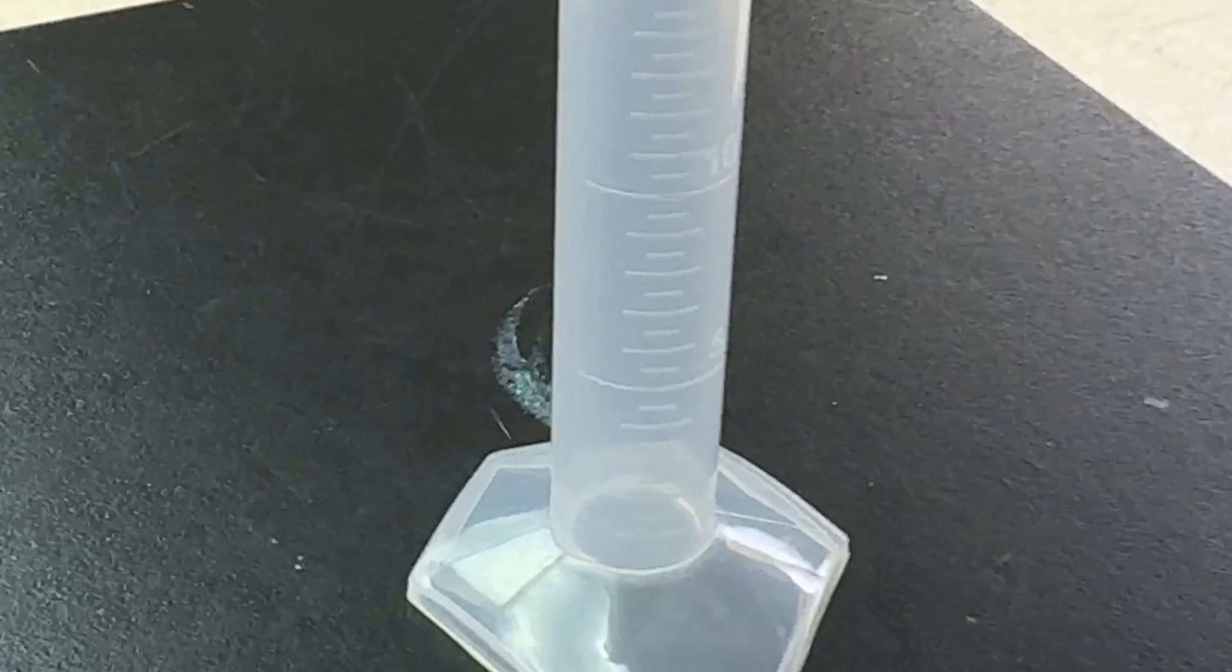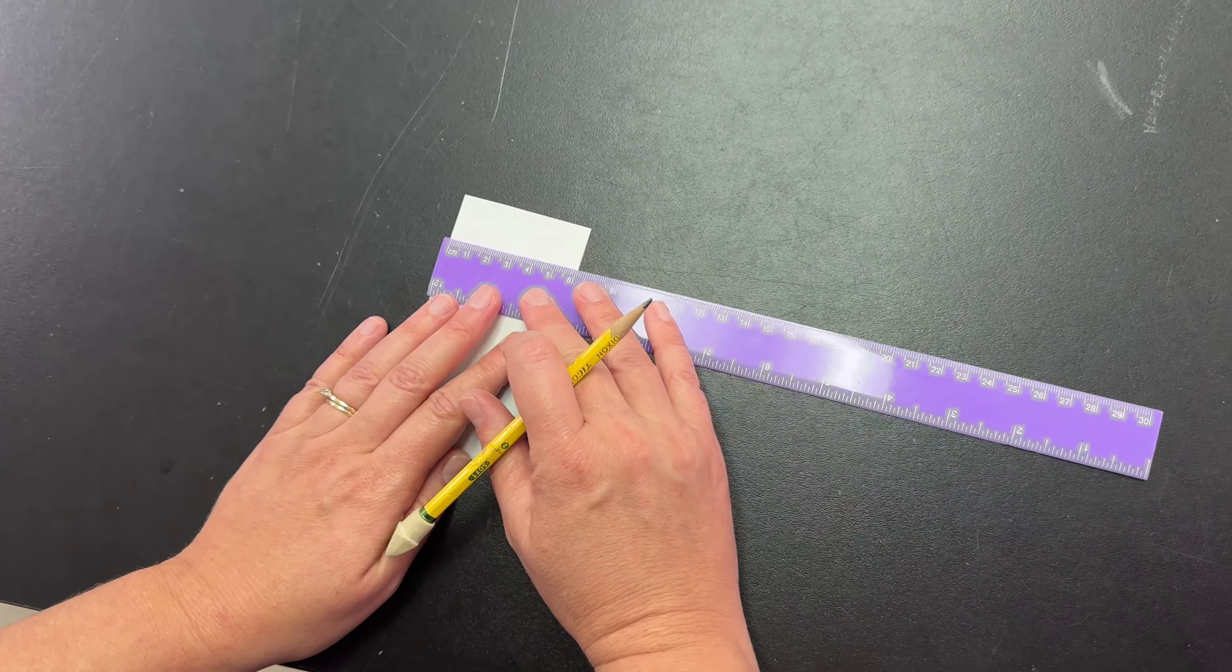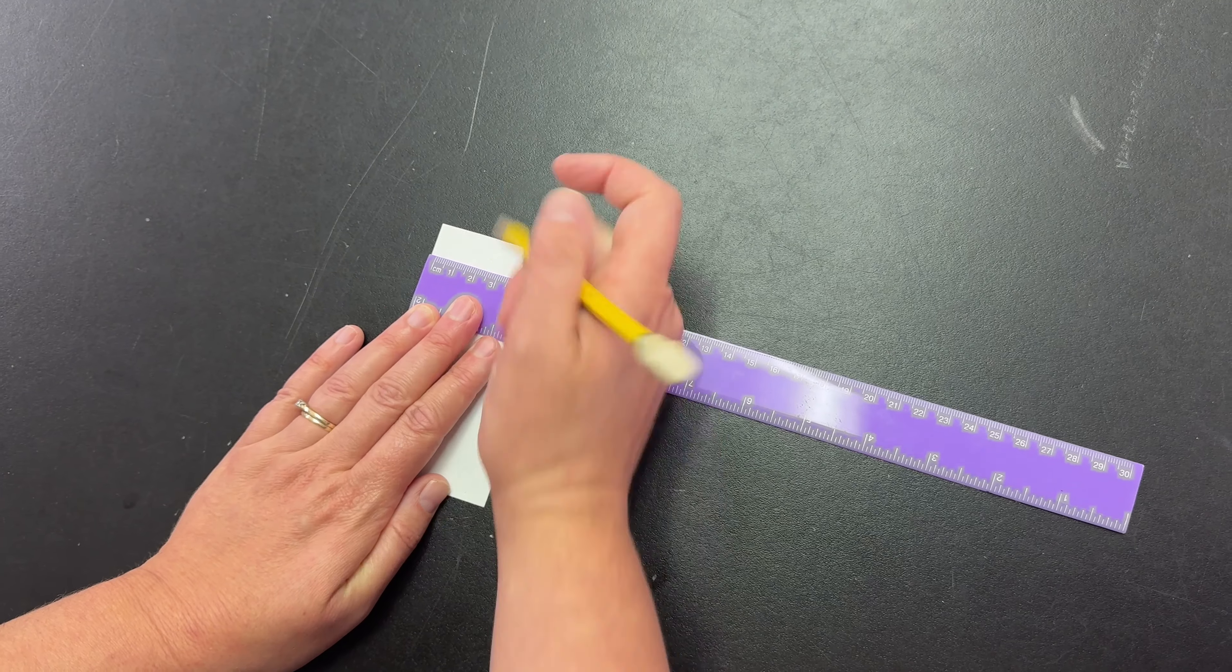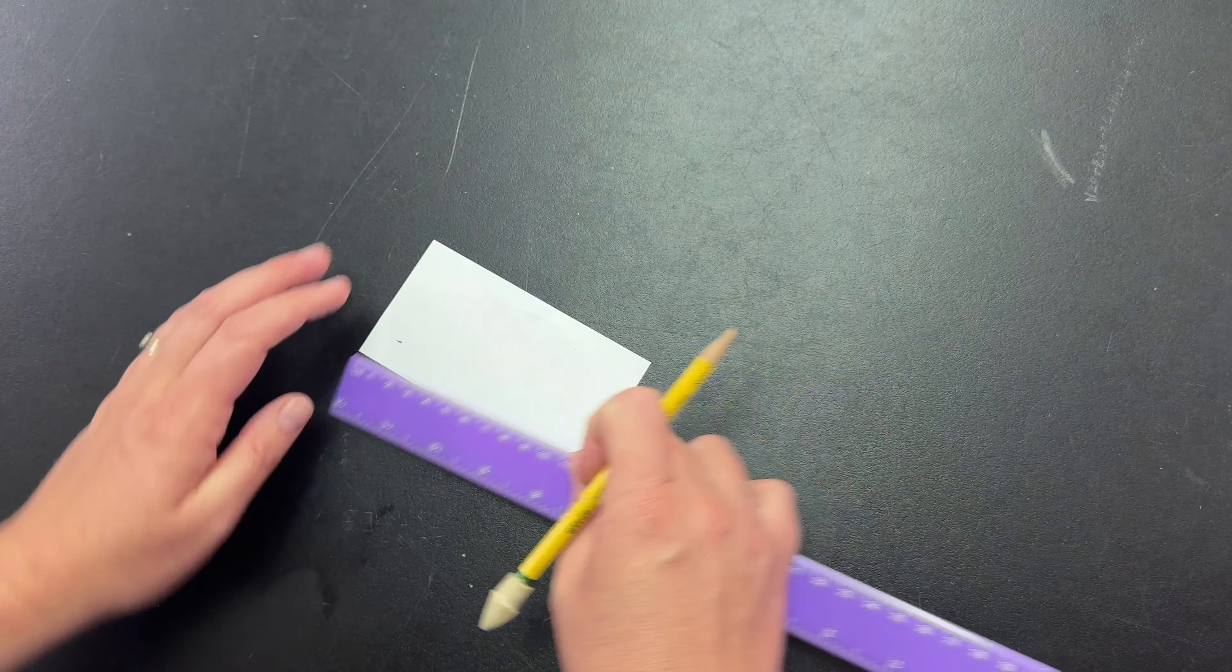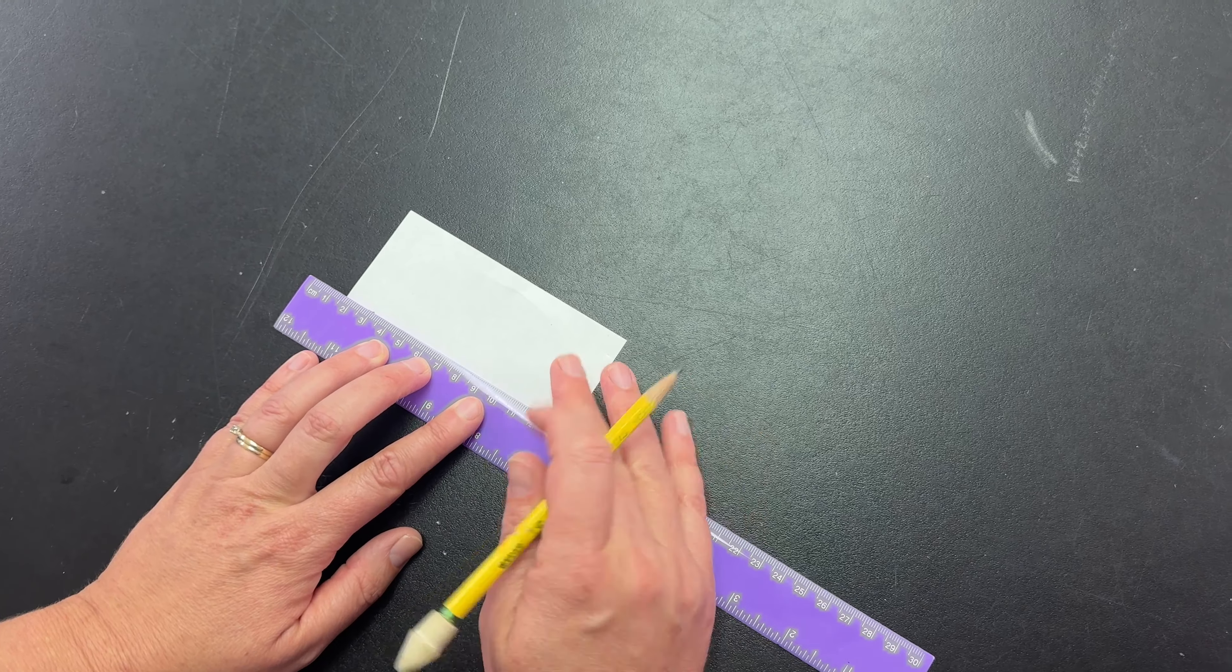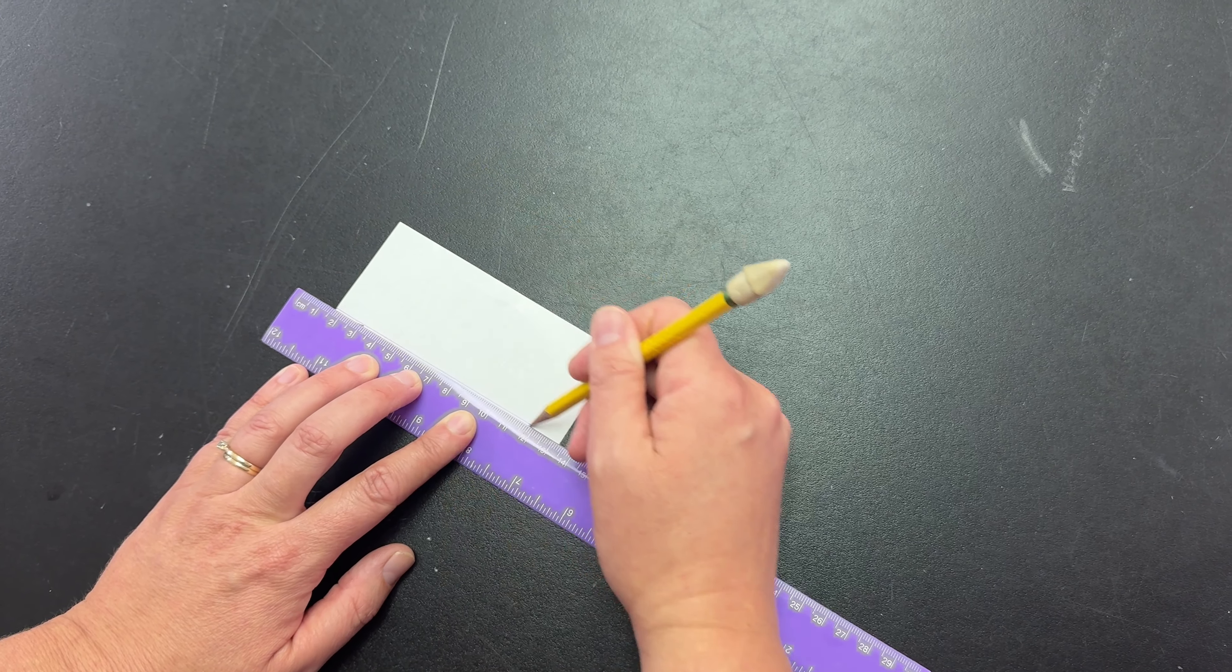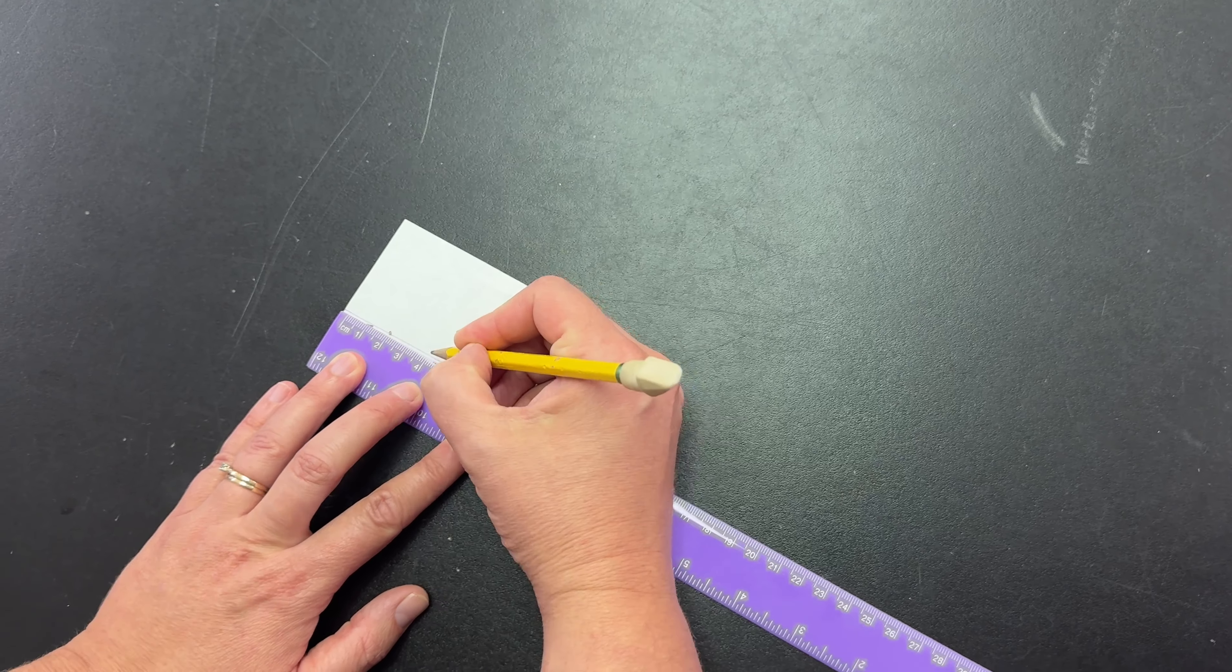Step one: use a pencil to draw a light line one centimeter from the edge of a 10 centimeter by 10 centimeter piece of chromatography paper. The pencil lead is insoluble in water and will not interfere with the experiment. Starting one centimeter from the edge, make marks two centimeters apart along the line.